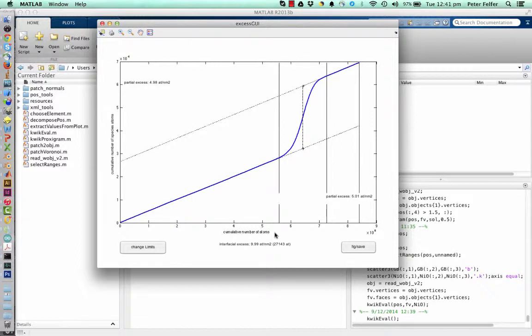Since this is a very simple case here, everything by default is already very good, but usually you would need to change limits and the like, especially with the next data file you see. And to do that, you'll click on change limits. You click on where the current limit is. The closest one that you want is, of course, 4 limits, 2 for the lower. So 1 you can't see right now.